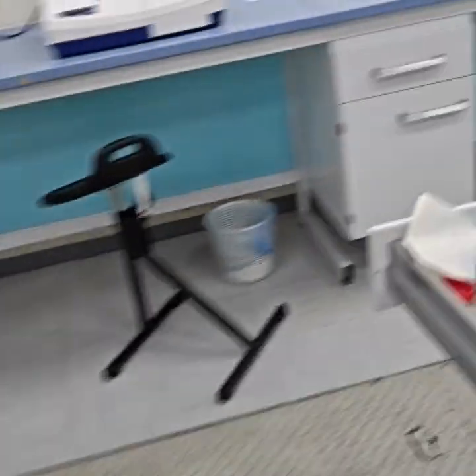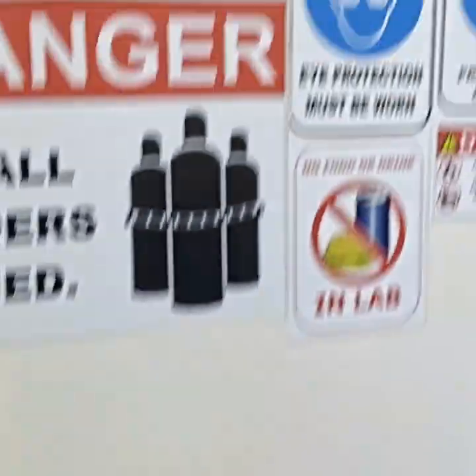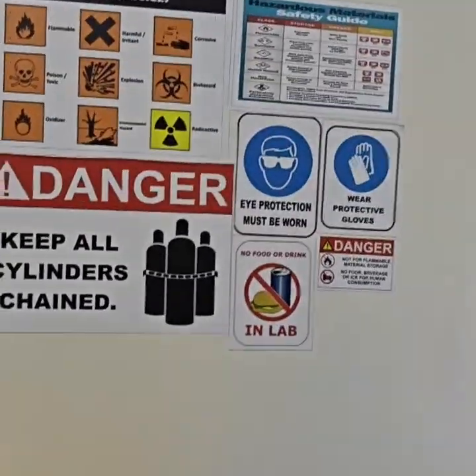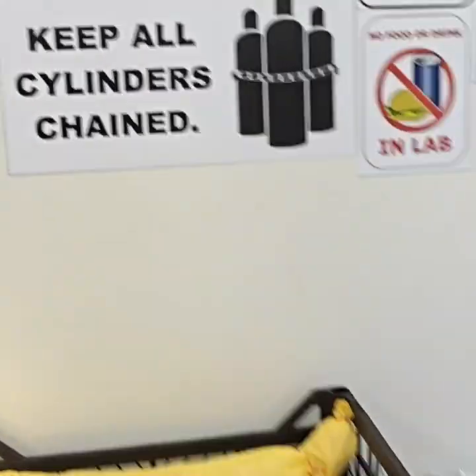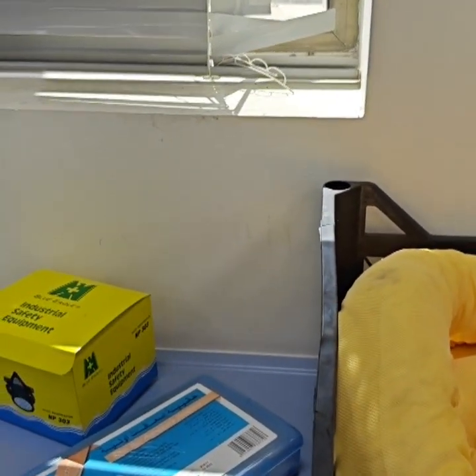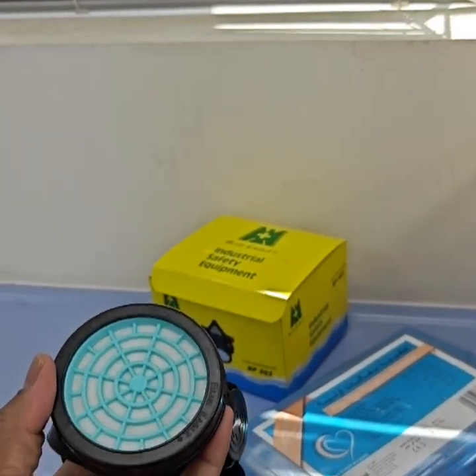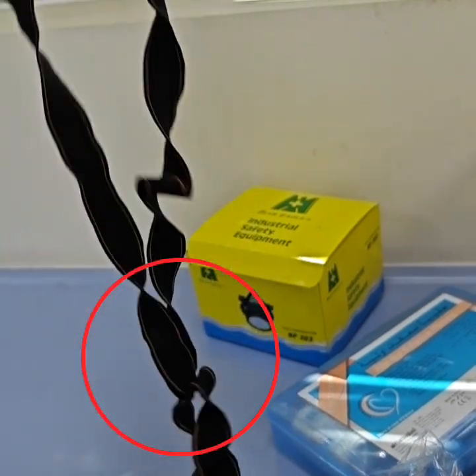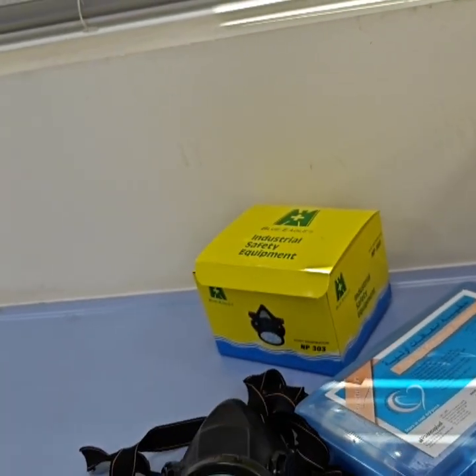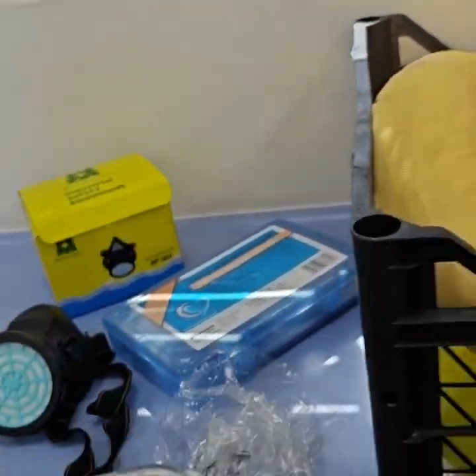I will show it to you right now. These are our spill kits, and we have a separate area for our safety storage kits, and this is our first aid kit. These are special masks to avoid any dust, smoke or fumes, so this will protect your nose. You have to wear it on your nose. This is industrial safety equipment, and these are our safety goggles.